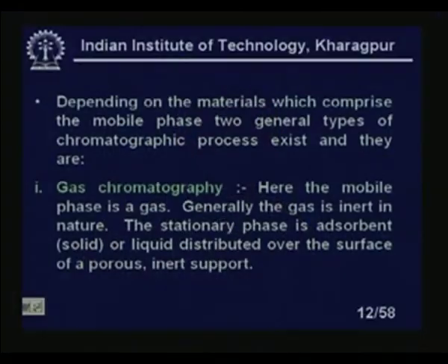This porosity is very small, in the order of angstroms, please note. The size of the porosity will give different affinities to the different gases or components of the gas mixture.